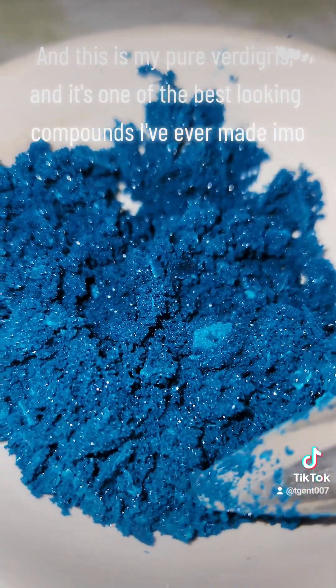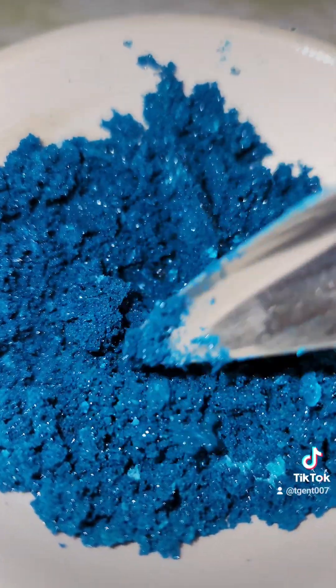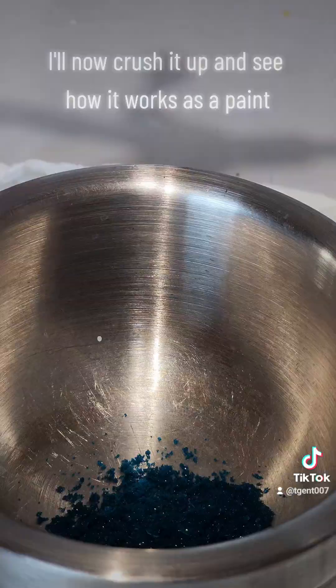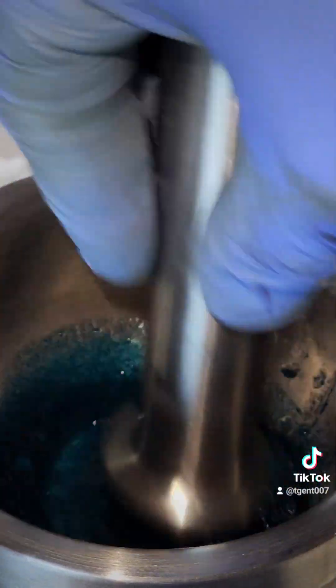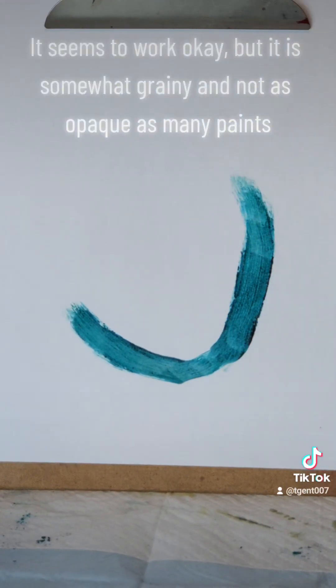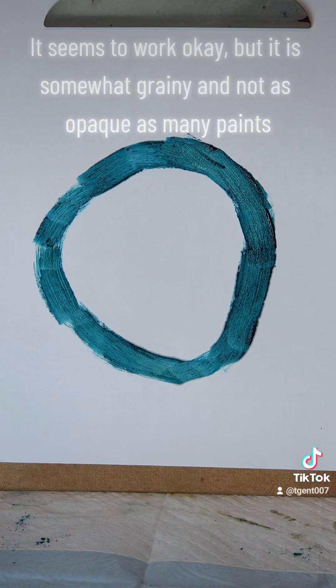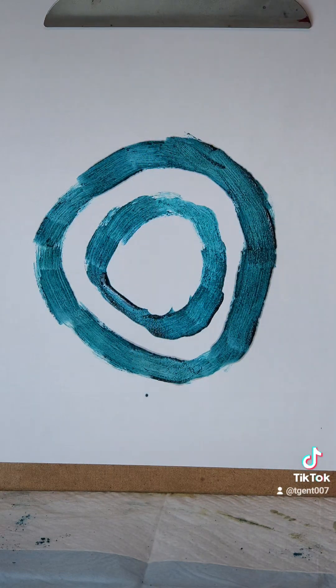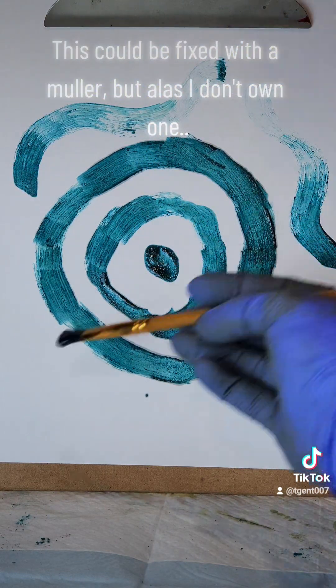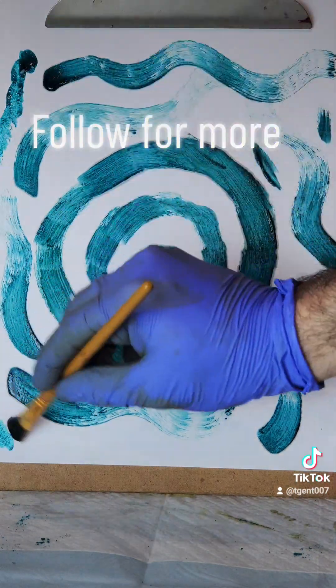And this is my pure verdigris, and it's one of the best-looking compounds I've ever made. I'll now crush it up and see how it works as a paint. It seems to work okay, but it is somewhat grainy and not as opaque as many paints. This could be fixed with a muller, but alas, I don't own one. Follow for more.